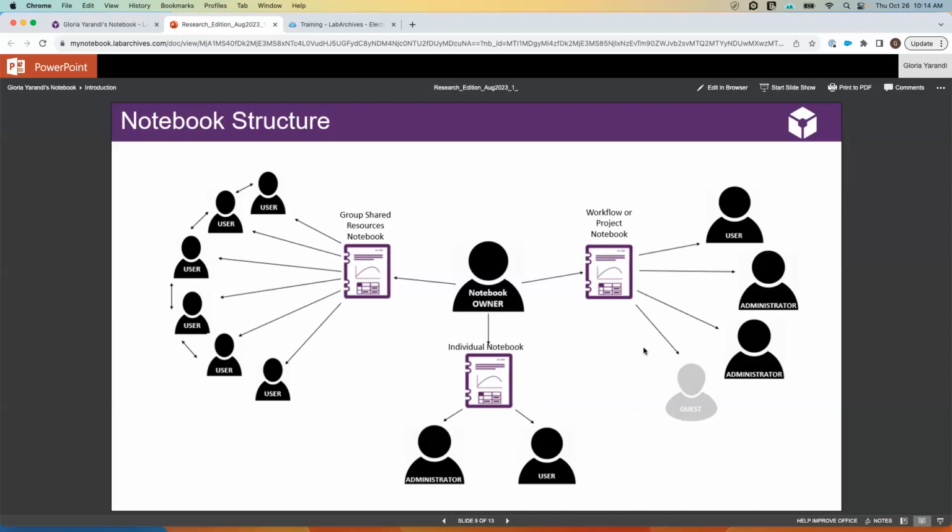So the main point here, you have a lot of flexibility and there's no right or wrong approach. We recommend you create a system that best mimics your current workflow and what may already be working well for you. With that being said, let's now transition to the live demo. But before I do that, are there any questions?